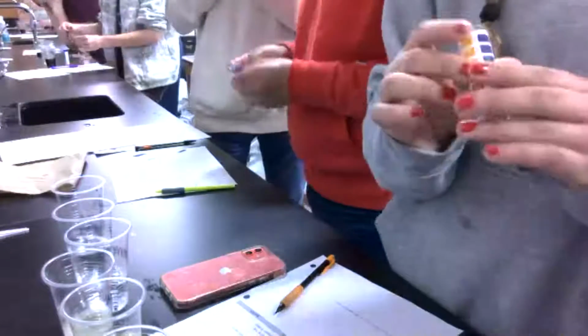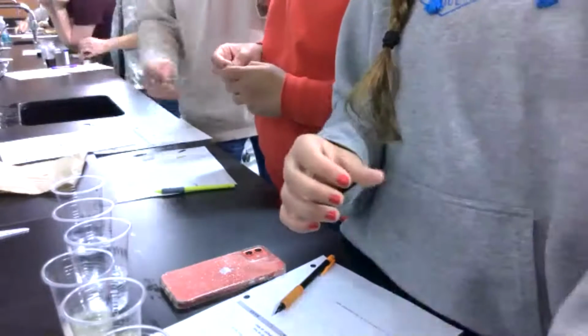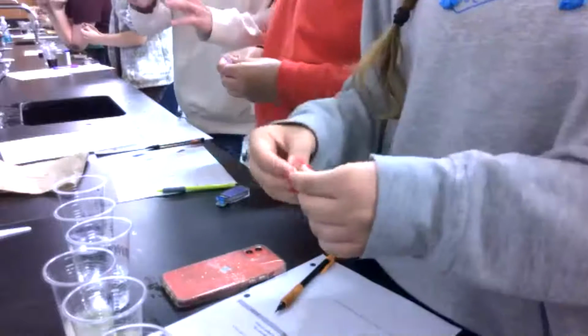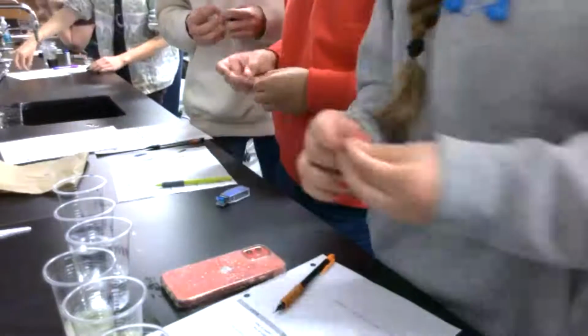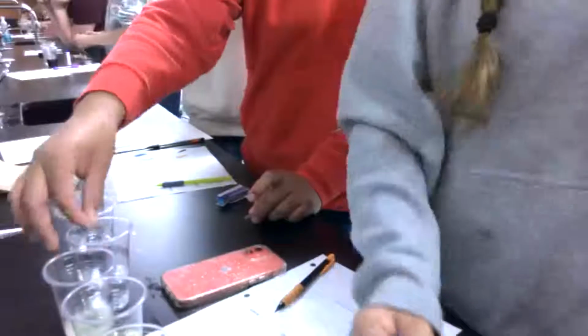Why'd you put Tide? Because that's what you said. It said laundry detergent. You said Tide or laundry detergent. And I put Tide down. It's Tide, but it's laundry detergent, so it all matters. It's not an acid. Here, look at the color. Okay. It's the bottom. Oh, that's just the color of the laundry detergent. It ain't red though. Wait, where did that come from? I don't know what that is. I don't know why I gave it to you. This needs to come here. I don't know where it's going. This is 7.5.